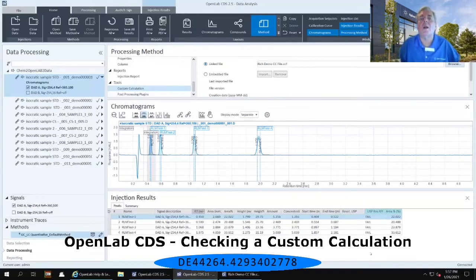So we don't want to turn on things that are going to be a drain on resources, on RAM, on services, on disk space, when we know you're going to have to redefine it anyway. So we don't even turn it on by default.